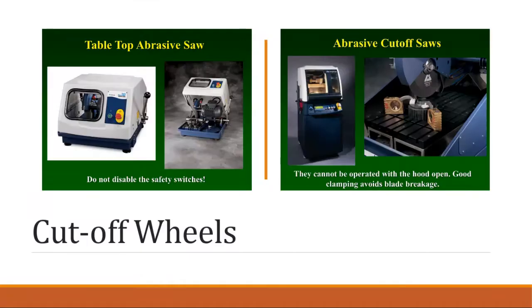Looking at the cutoff wheels, we do have 2 wheels that are very similar to the one on your right side, the abrasive cutoff wheels. They are used to cut larger samples into smaller pieces. I believe the one that we have fits up to a 16-inch blade, and the smaller of the 2 takes 12-inch blades, if I'm not mistaken.